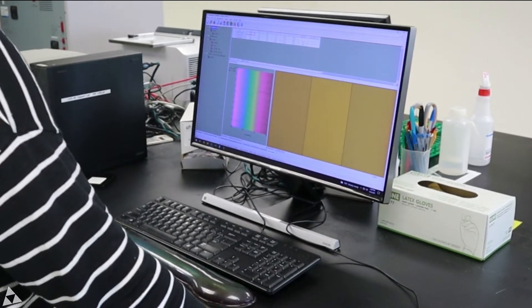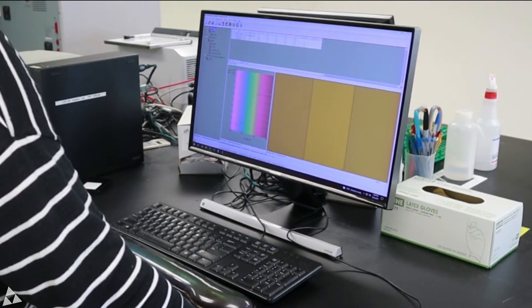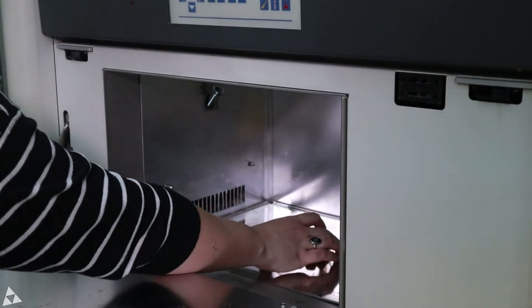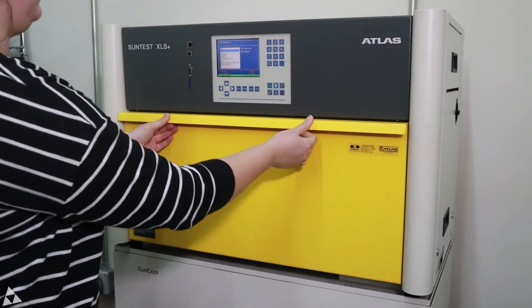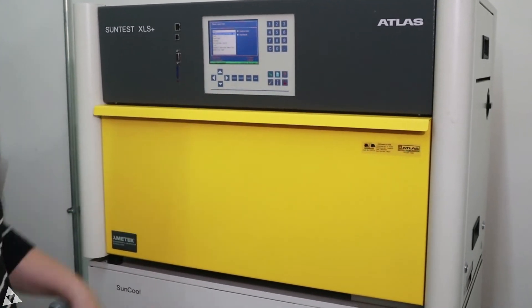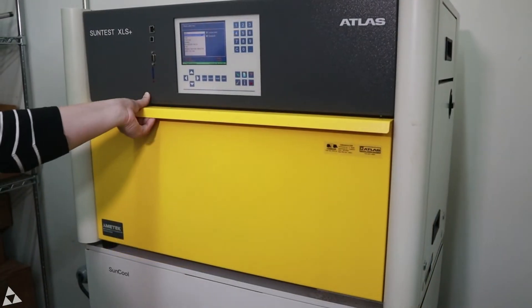We want the color to remain as close to this measurement as possible throughout the light test. Once we have our baselines, it's time to start the test. We put one of the samples into a light box, and another is kept in the dark as a control. We'll test the cheese balls for one hour in this box.